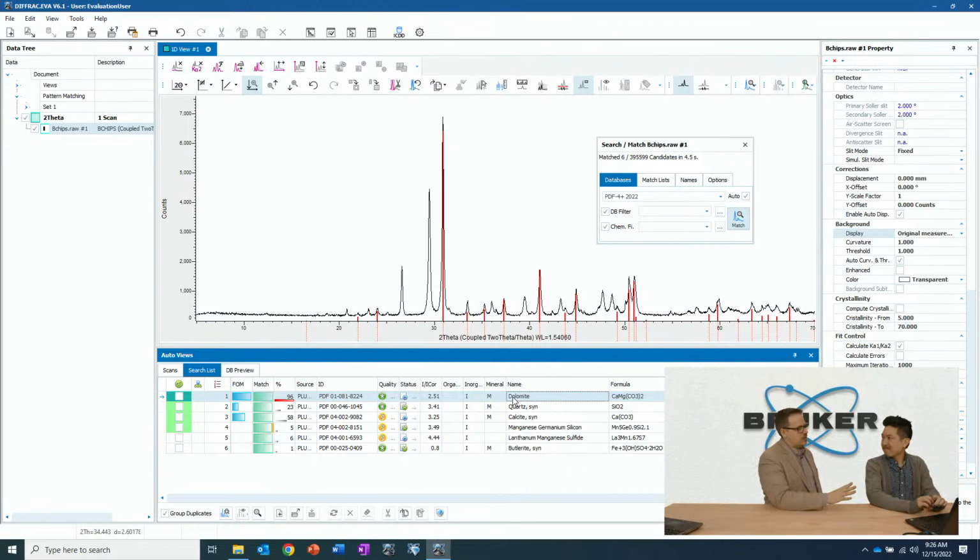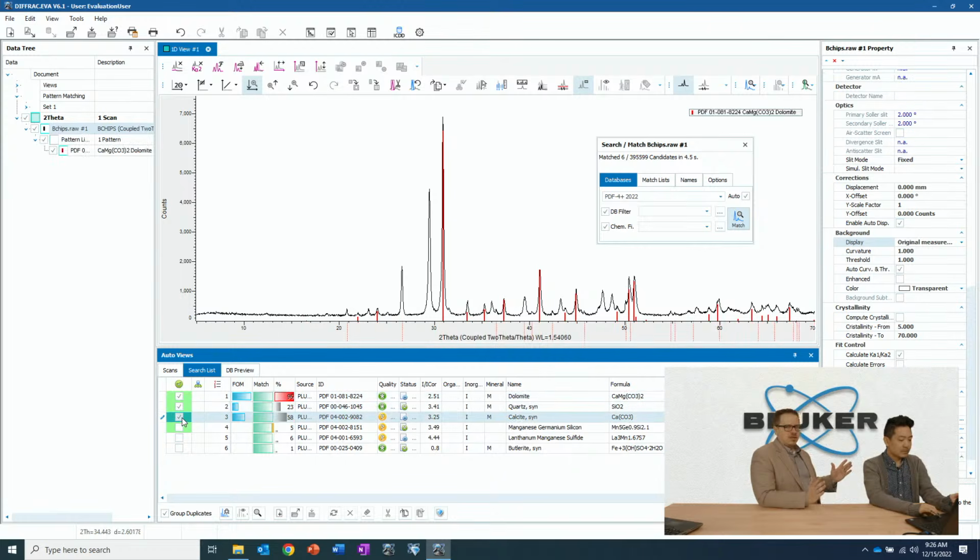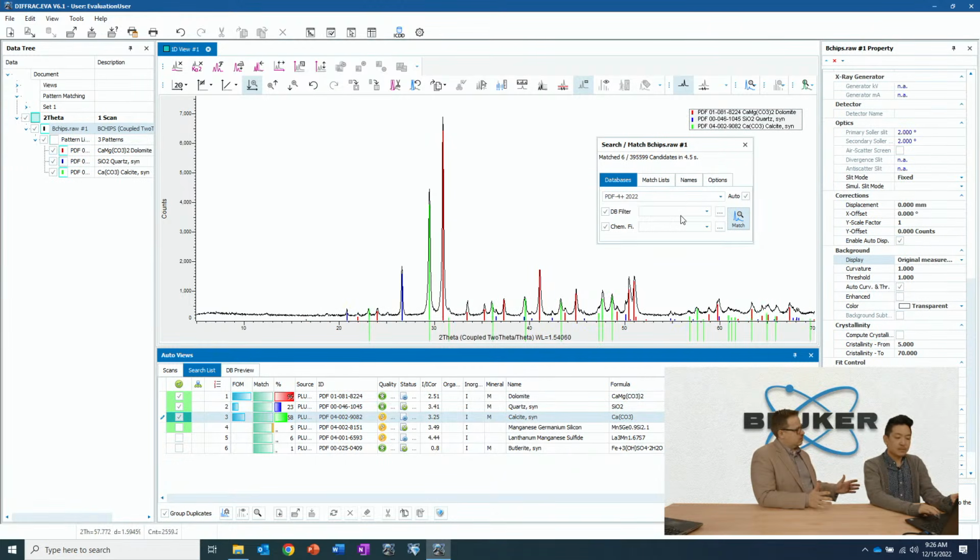Exactly. Right. Okay. And so this, again, you can think about it kind of like match list, right? Yeah. It's a way to get you something that is less unwieldy to navigate. That's right. It's a smaller set of things. And if you're going to use the auto tool, one of the big things, try to get a match list going. So you at least have a subset of the hundreds of thousands of possibilities.